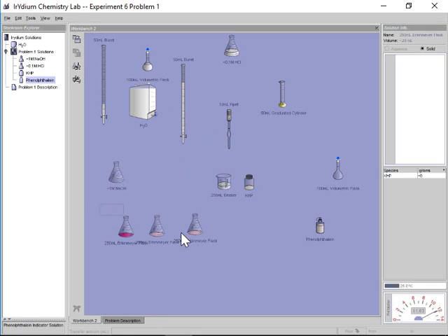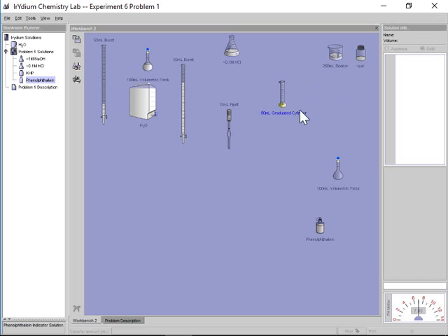I'm going to get rid of my acid solution and the other solutions. You can just highlight them and delete them off. Right. This is my KHP solution. I might still need that, so I'm going to keep that on the side. Any leftover glassware I don't really need. You do want to be rinsing out your glassware, so I'm just going to pull out a fresh pipette.